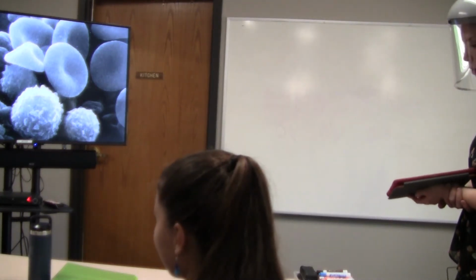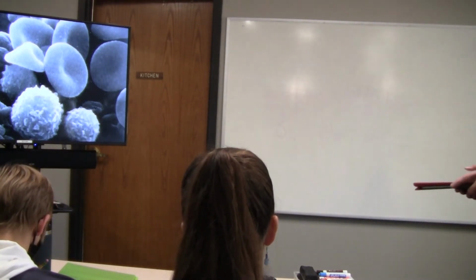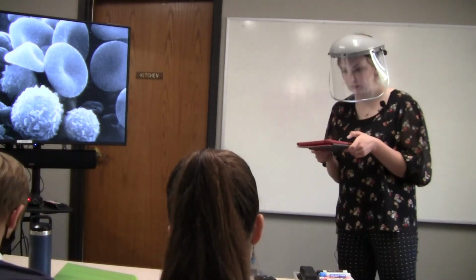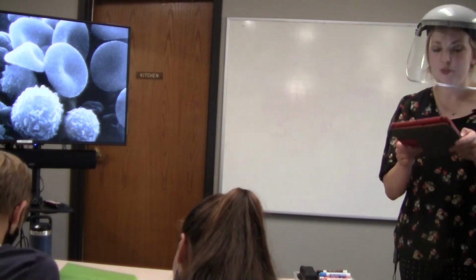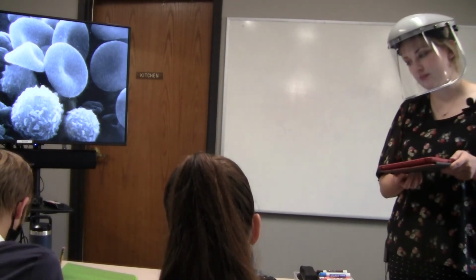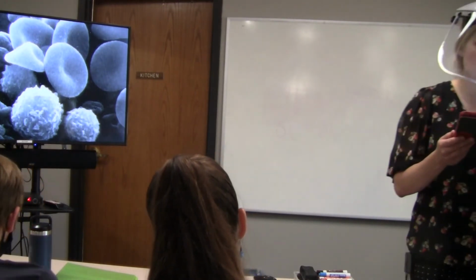It supports the upper part of the microscope. This is the arm of the microscope. It's also how we carry the microscope. It's located on the stage and adjusts the amount of light that passes. It's the diaphragm. The bottom of the microscope, used for support. That is the base. It's a light or mirror that projects light through the diaphragm. This is the light source.